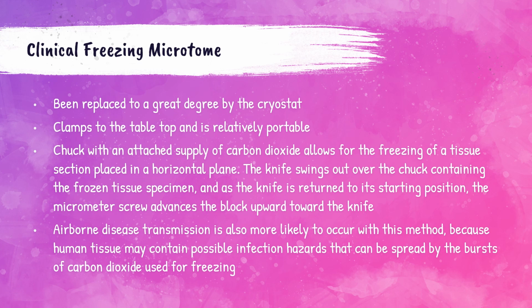Transmission of airborne disease is more likely to occur with this clinical freezing microtome because the bursts of carbon dioxide may spread human tissue. And like I said, it's mainly been replaced by the cryostat.